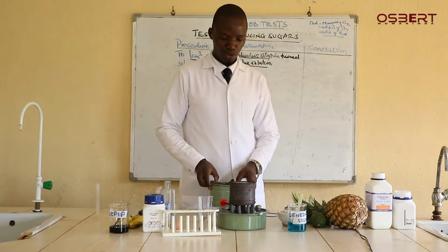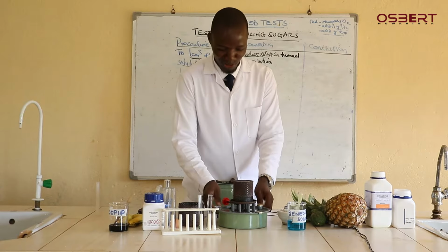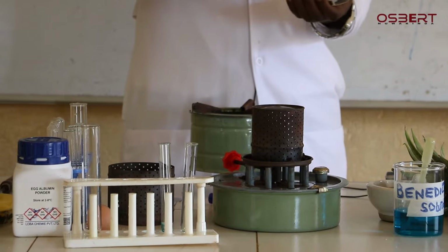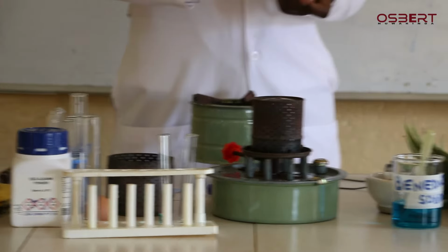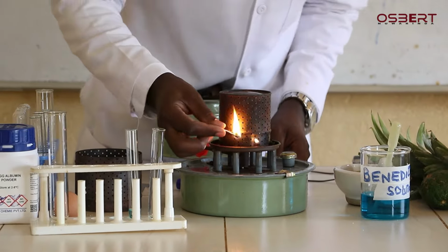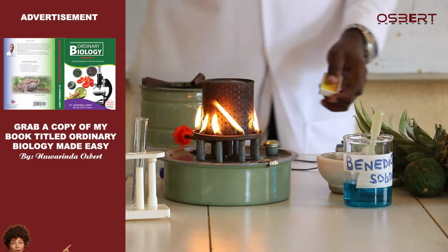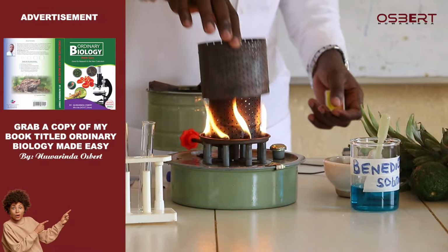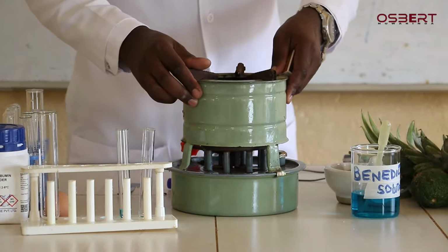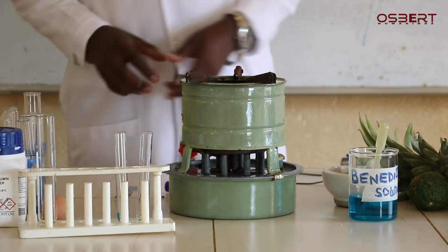Now, for some of you who don't know how to light a stove, you will use this lesson to learn how to light up a stove. So I have my stove here, which has paraffin inside there. I'm going to light it up. For those who don't know how to light a stove, use this lesson to learn. Yeah, so I come and light up my stove there. That's what I'm going to use. Like that. I have my stove there. Yeah, so this stove is what I'm going to use.